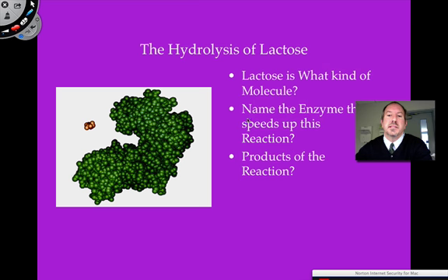And lactase splits the disaccharide; the products are glucose and galactose. And so how do we know it's working? You can test for the presence of glucose or the presence of galactose. You can do that, but it's a little bit difficult to examine that.